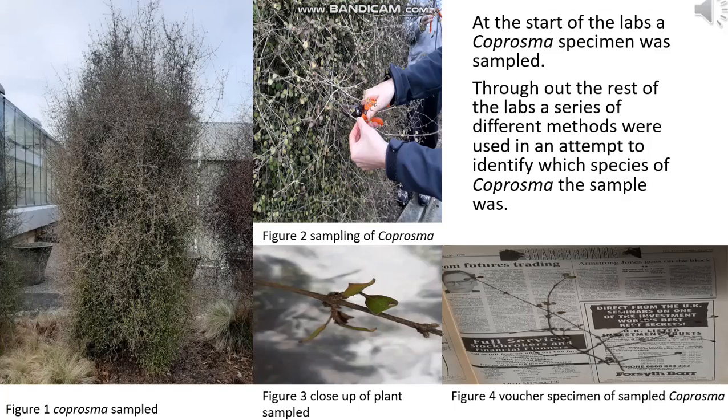At the start of the labs, a coprosma specimen was sampled. Throughout the rest of the labs, a series of different methods were used in an attempt to identify which species of coprosma the sample was.